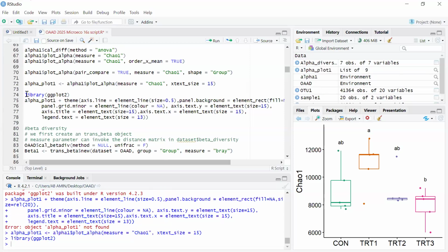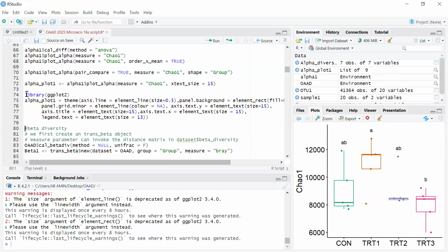So this is just to add some little formatting from ggplot. So you can modify the colors the way you want it. I'm not really very good in R. So I do play with it, but it's giving me headache. I'm still learning. So that one can be modified according to your preference with ggplot too.